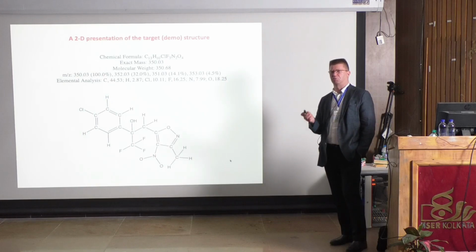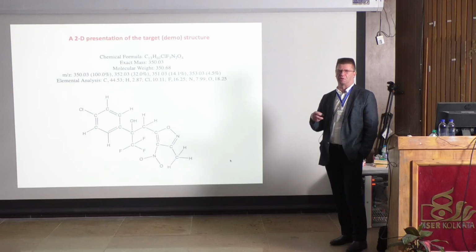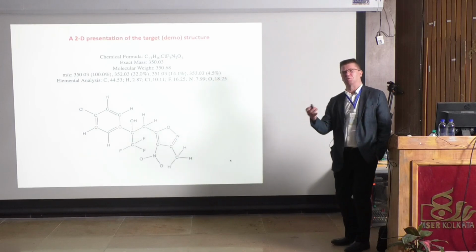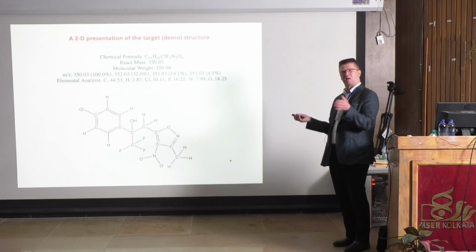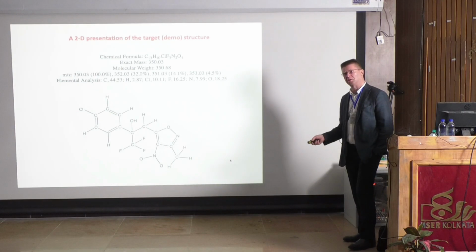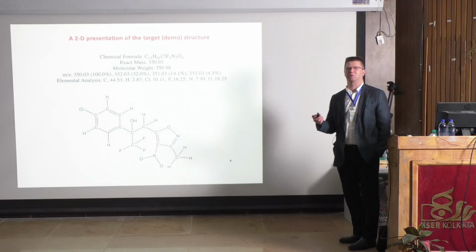And then tomorrow, in lecture 10, I will show you structures where the molecular weight is 13,000. So it's the size of a small protein. But anything is done in the same way. It doesn't matter if it's a small molecule or a big molecule, the same thing applies. And then this is the cartoon of this. And now we already mentioned, okay, it's chiral, but sometimes we don't know.